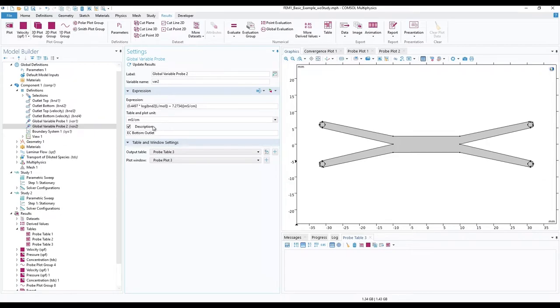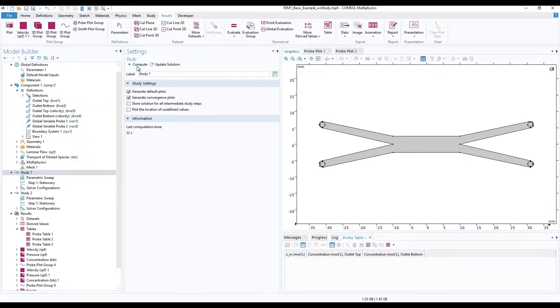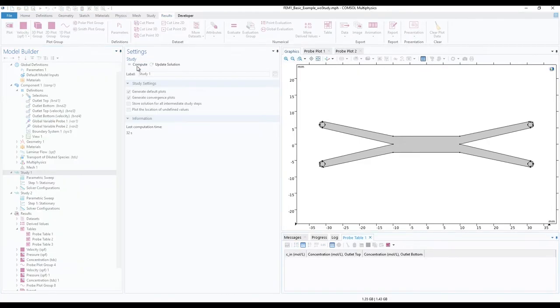Next, go to study 1 in the model builder ribbon and click compute. In the following simulation, we will sweep only the input concentrations, as already pre-configured in study 1.